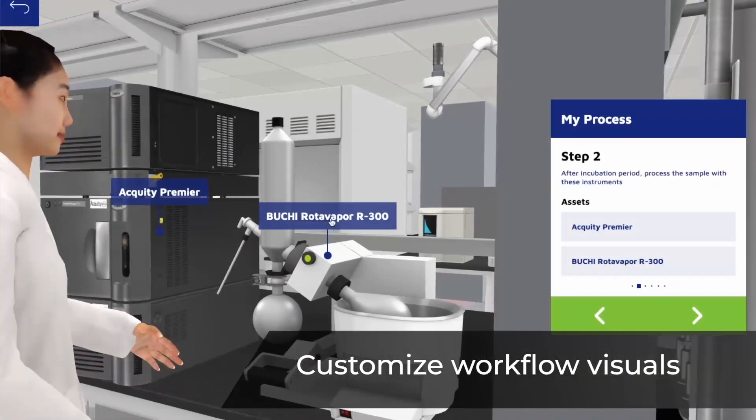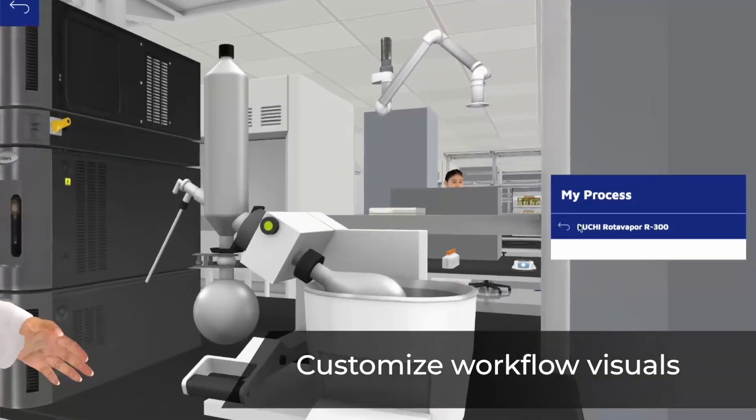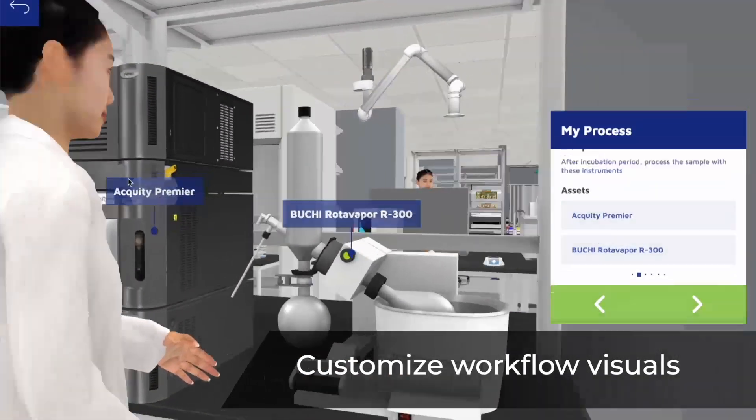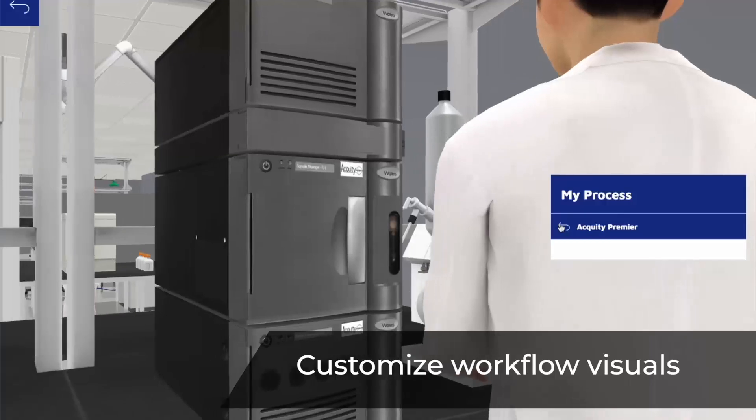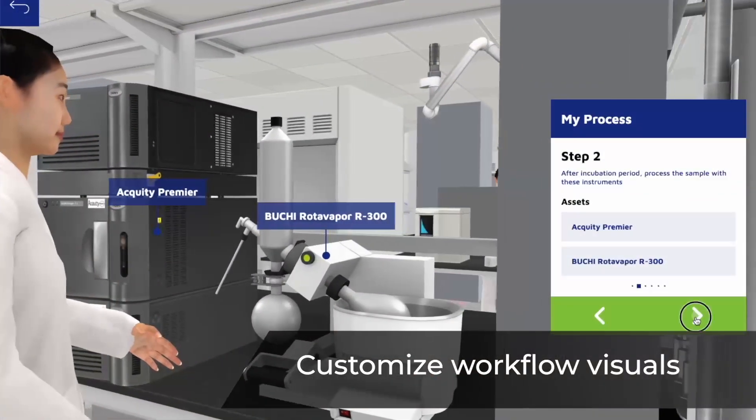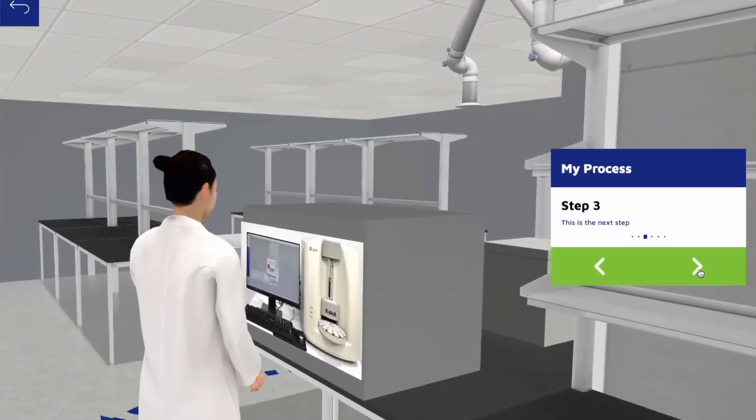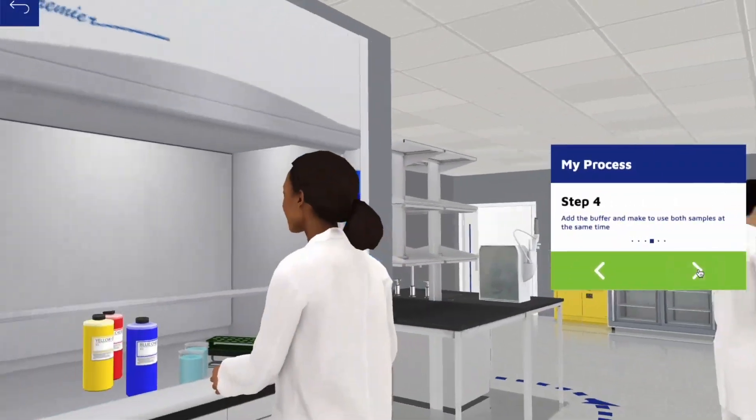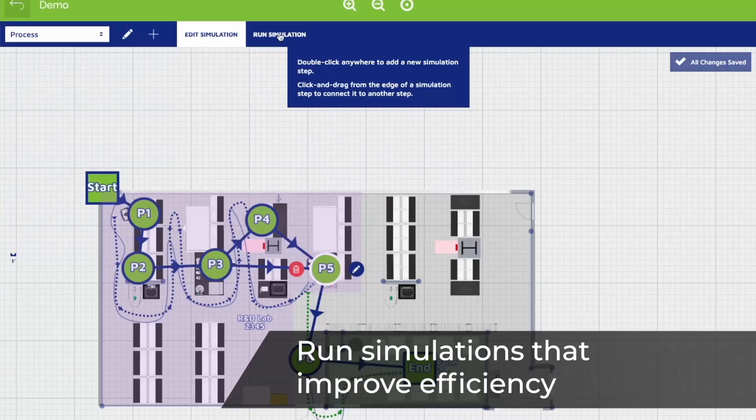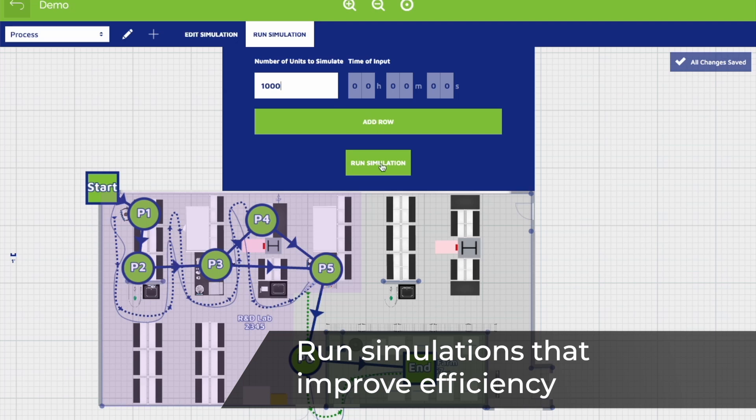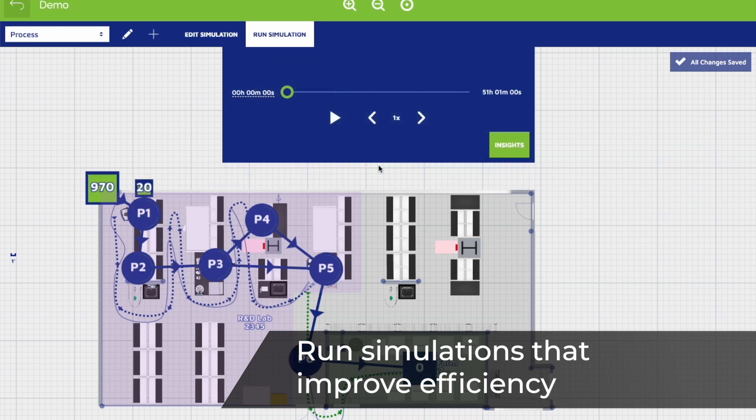Turn complexity into clarity. Guide teams with interactive step-by-step workflows. Test before you build. Simulate workflows to spot inefficiencies and improve throughput.